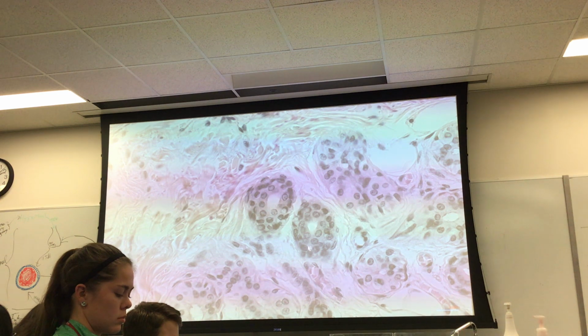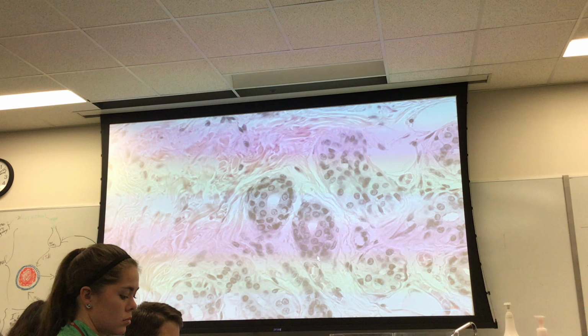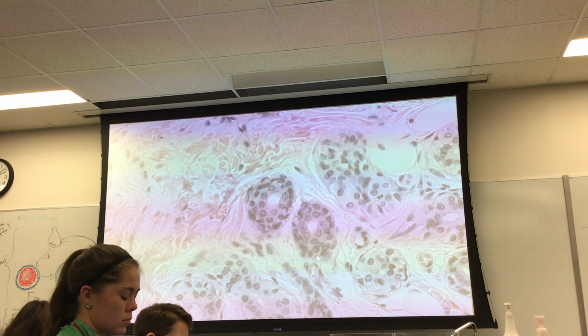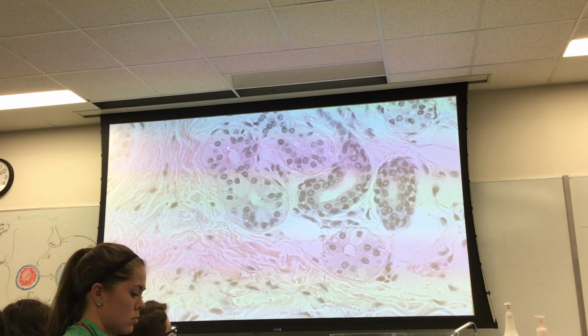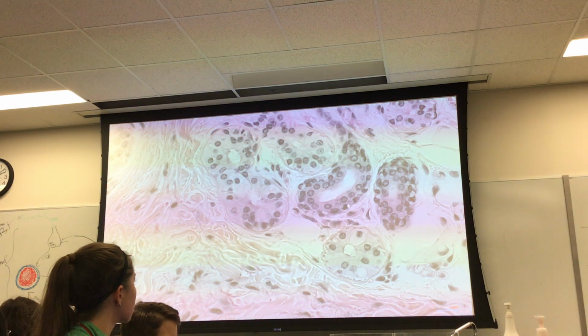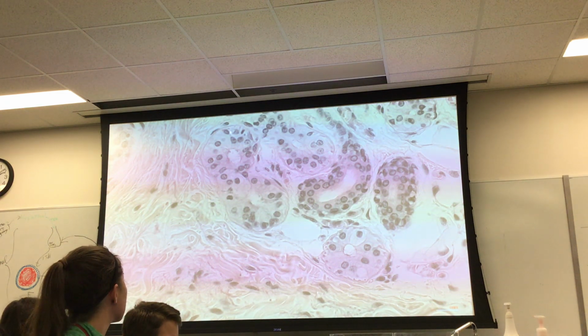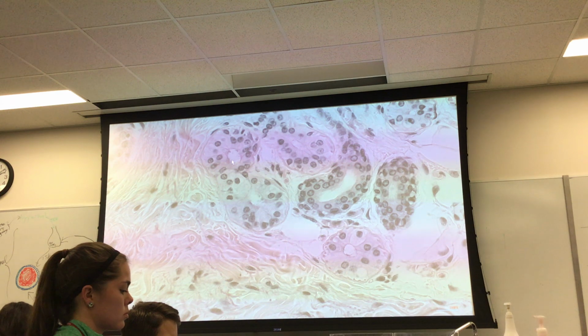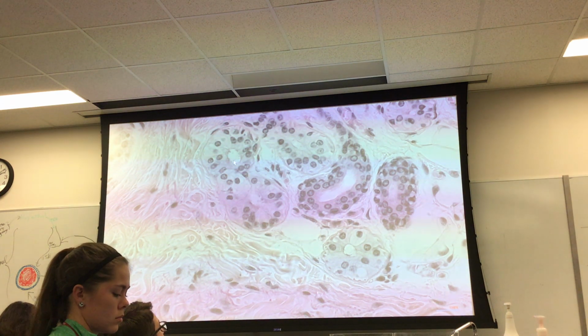As a structure, what is this called? So that's the tissue type. As a structure, that is a duct of an eccrine sweat gland. These are the secretory portions of an eccrine sweat gland. So stratified cuboidal is the duct. This kind of simple arrangement here, pyramidal type cells, that's the secretory part. Okay? All right.